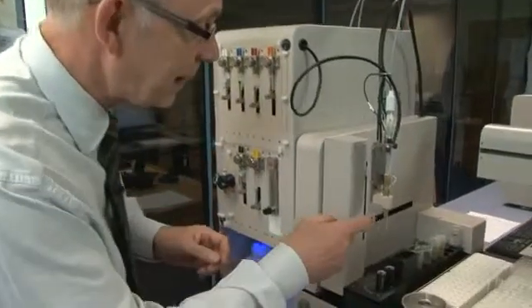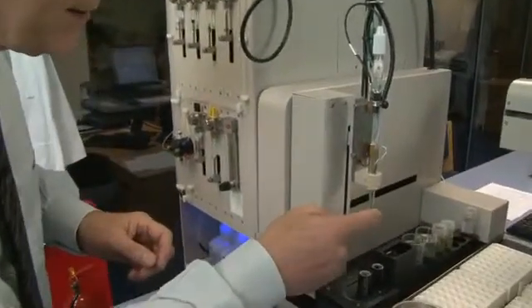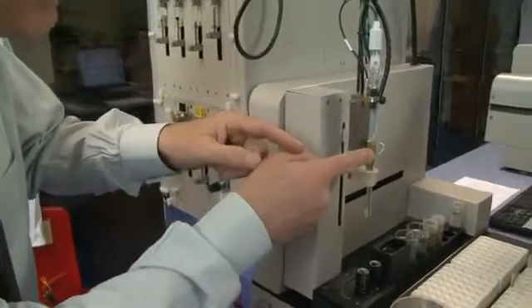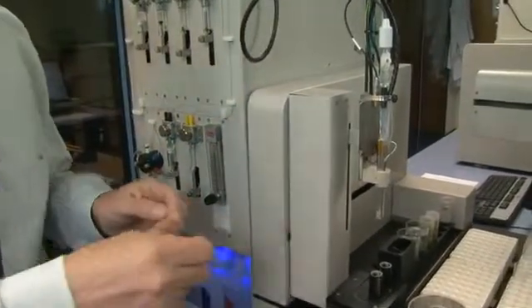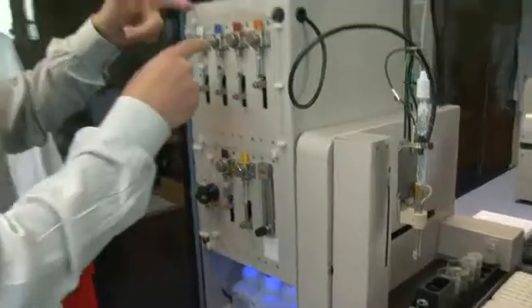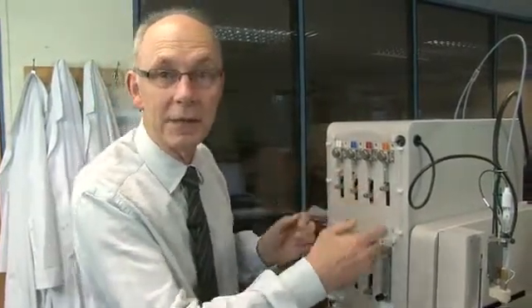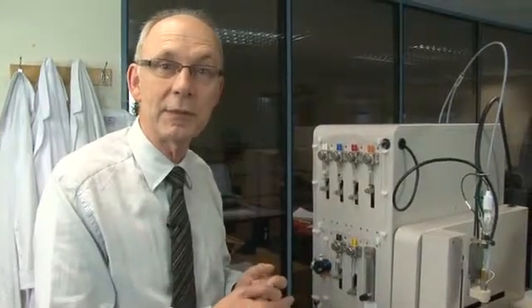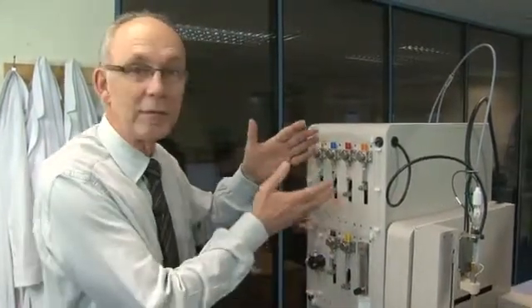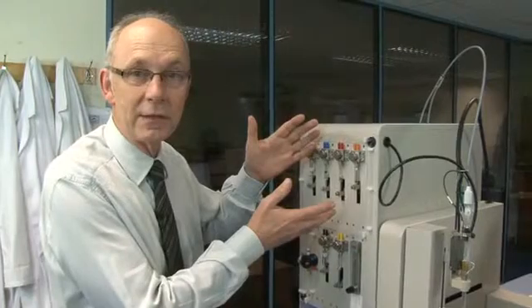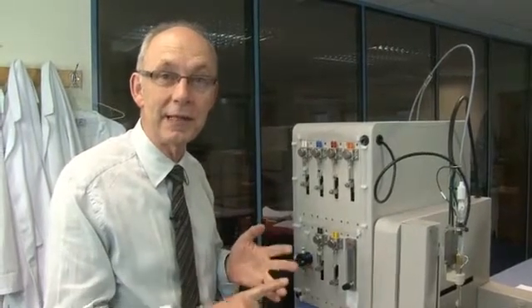Then on the right hand side we have this ceramic. You can see it looks a grey colour with a brass thing on the top. This ceramic contains six tubes brought from these six dispensers. Each of these tubes carries a liquid and dispenses it into the solution during measurement. And these do the job of a burette in a normal titration experiment, except that these have very small volumes. The smallest volume we can get from one of these dispensers is four ten thousandths of a milliliter.